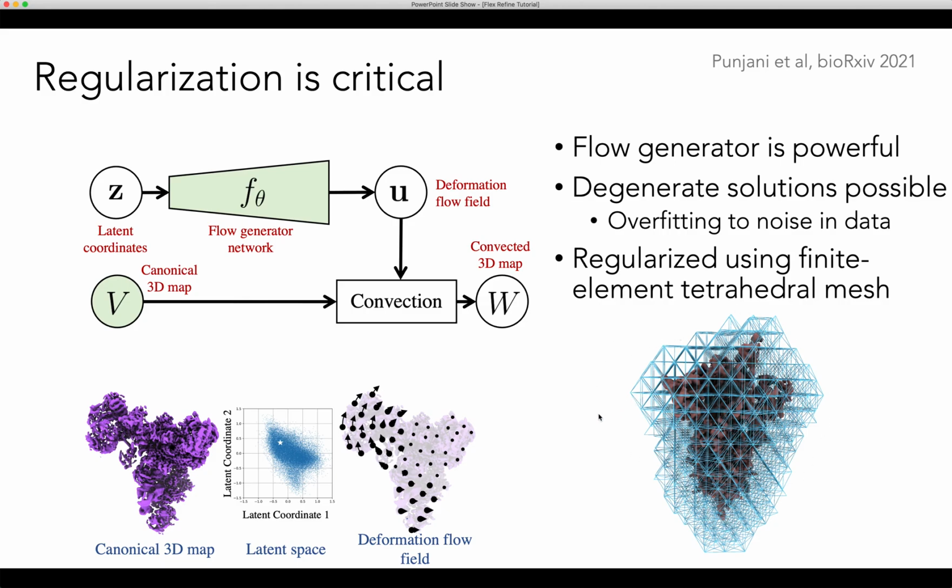And that default mesh generation does work well in most cases, and you should always use it as a first cut to see what kinds of different motion and conformations the 3D Flex model is detecting. However, 3D Flex does support any mesh topology or any mesh construction that you might want to use.